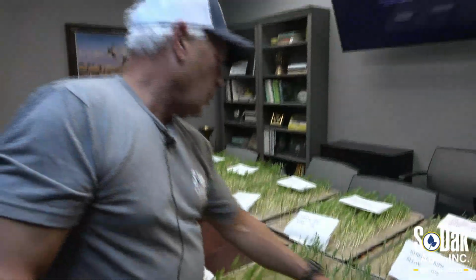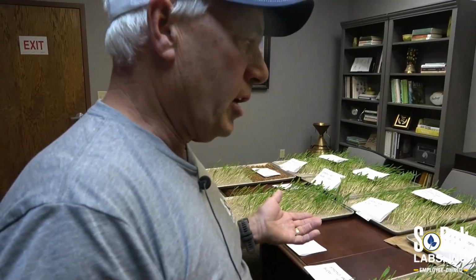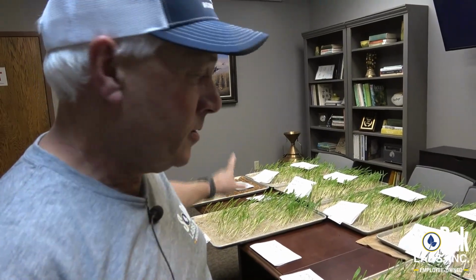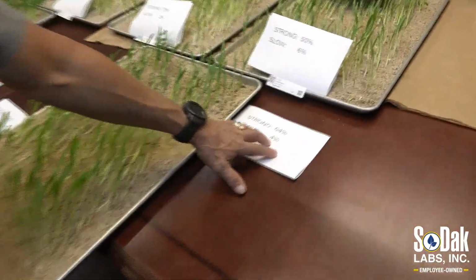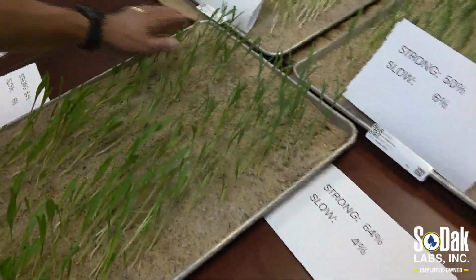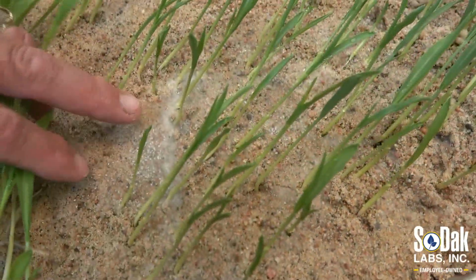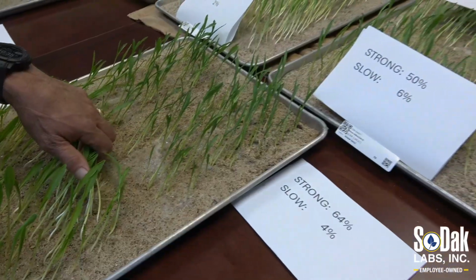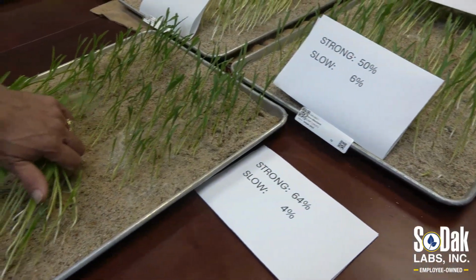So anyway, the accelerated aging, not quite the discrimination of the 50 Fahrenheit cold test, but something very interesting at the end here. So we got a 64 plus 4 slow on this. You see a little bit of saprophyte coming in here, but a 68 accelerated aging is a decent score for sweet corn.